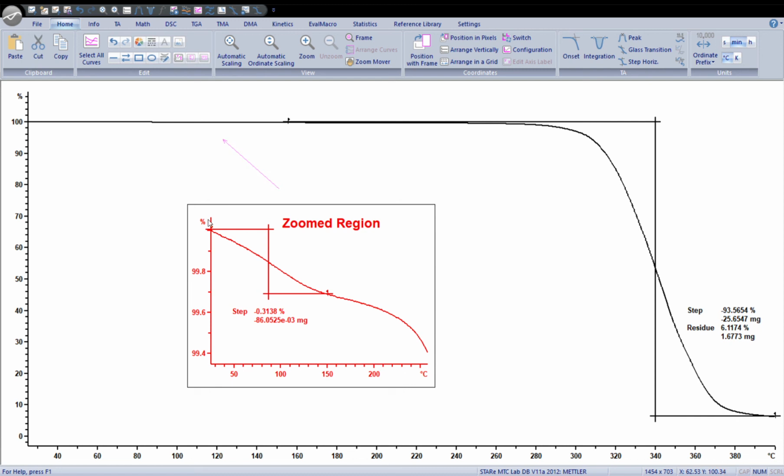I'd like to maybe make those lines a little thicker to just make it stand out a little bit. You can right click on it and choose edit the line type, or there's a button for it under the Home menu. Make those a thickness of 2. That looks pretty good. I think I got a pretty good plot here.